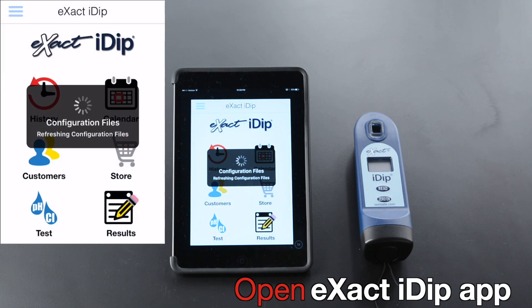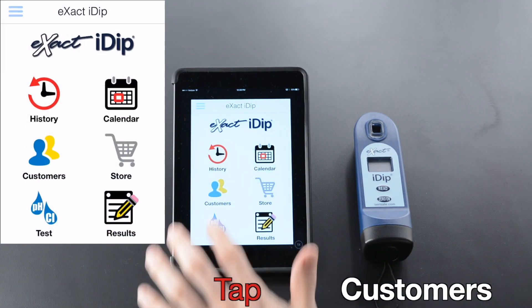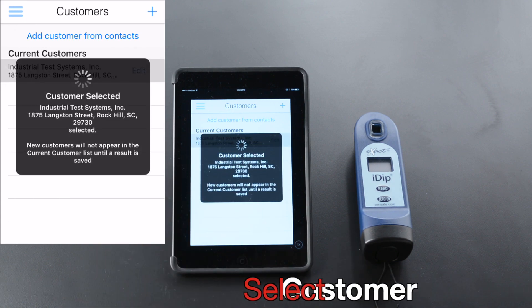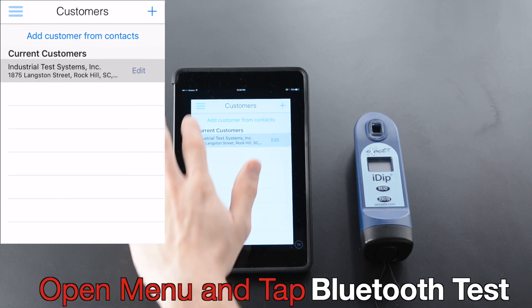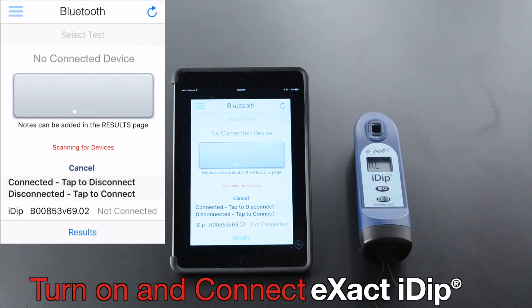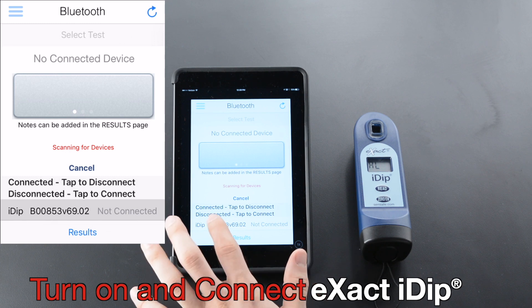Open the XactiDip app. Tap Customers, select Customer, open Menu, and tap Bluetooth Test. Turn on and connect XactiDip.